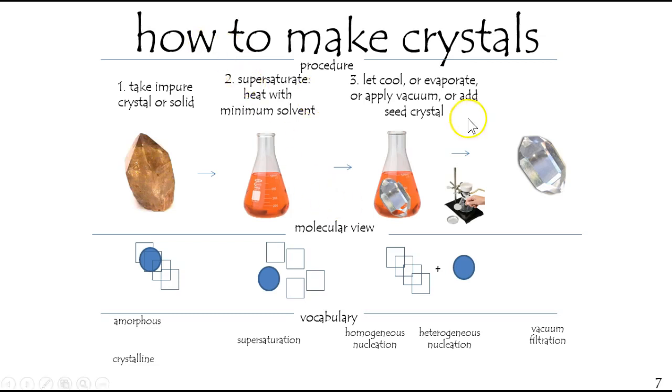Seed crystals, this process is known as heterogeneous nucleation. Letting it cool would just be homogeneous nucleation since you're not adding anything. And nucleation in general is the process of a crystal formation, the very first molecule.